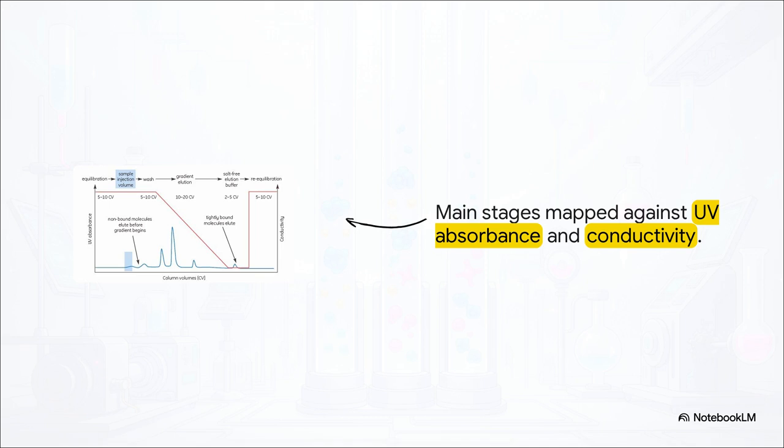But at the exact same time, look at the blue line. That's our UV absorbance, showing us the proteins themselves. Literally, as the salt drops, you can just watch those tightly bound molecules finally let go, popping up as these beautiful, distinct, highly resolved peaks.